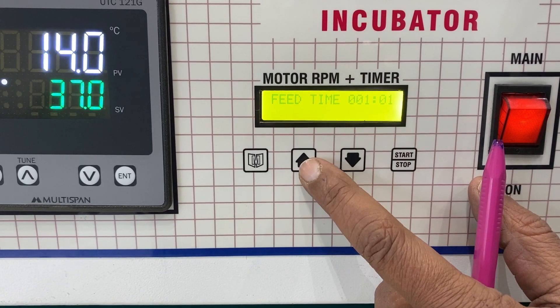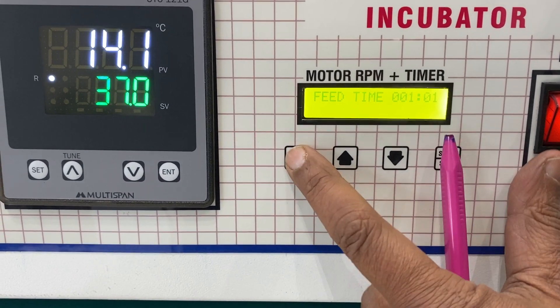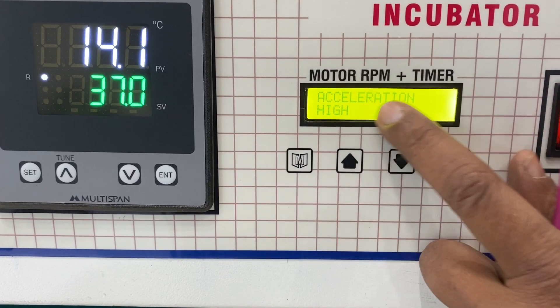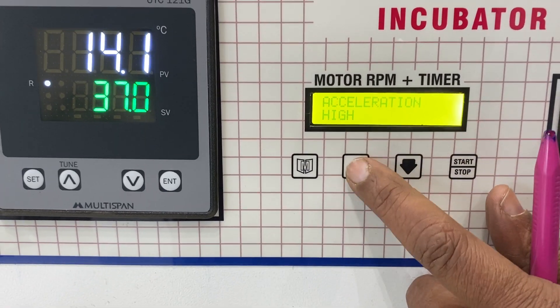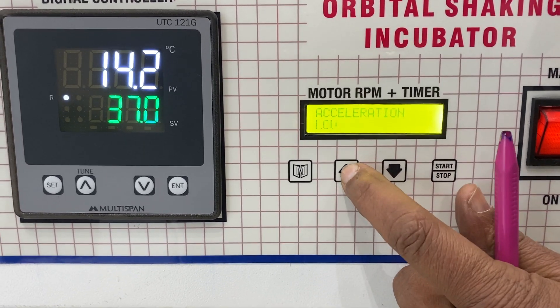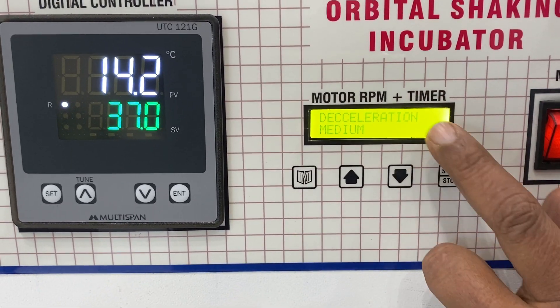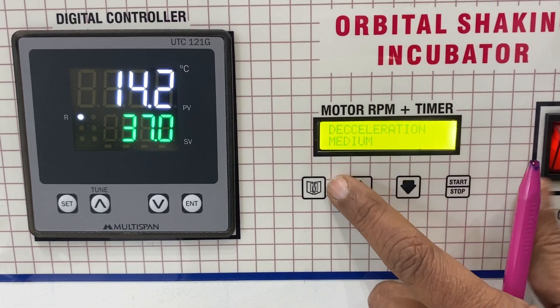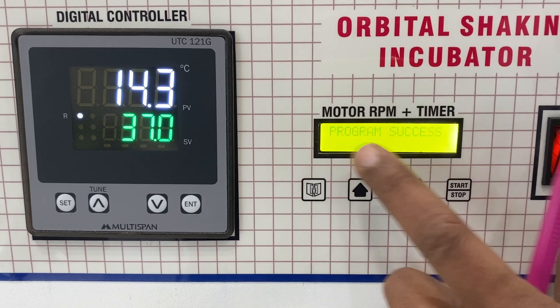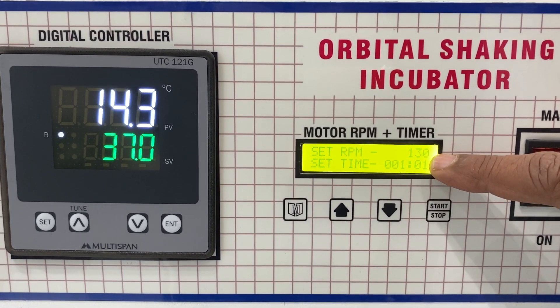Now for the timer: I can increase the time — 1 minute and 1 second. This can go up to days and more. Then press Enter. Now it tells you acceleration: high. I can make it low, medium, or low. Let me put it on high acceleration and go back.